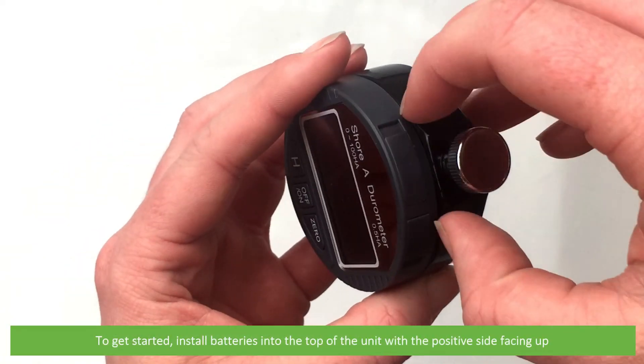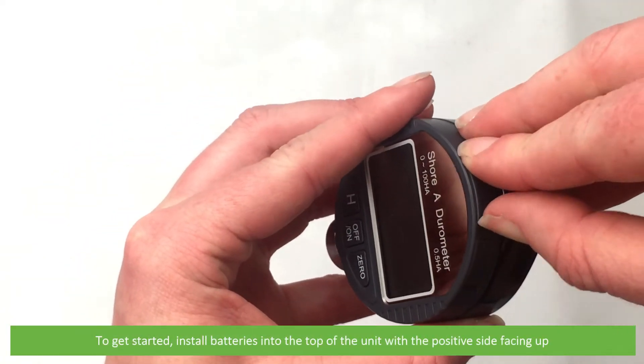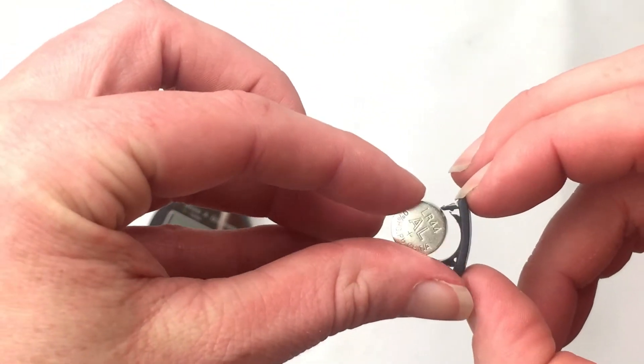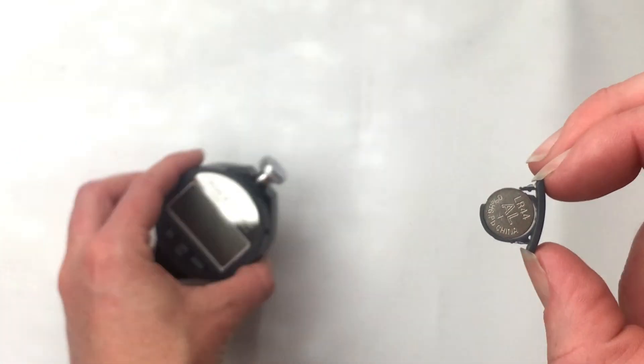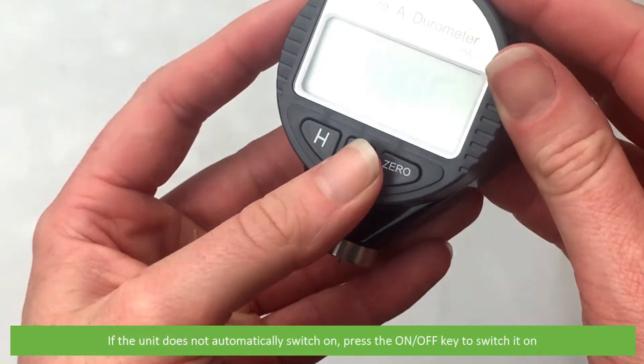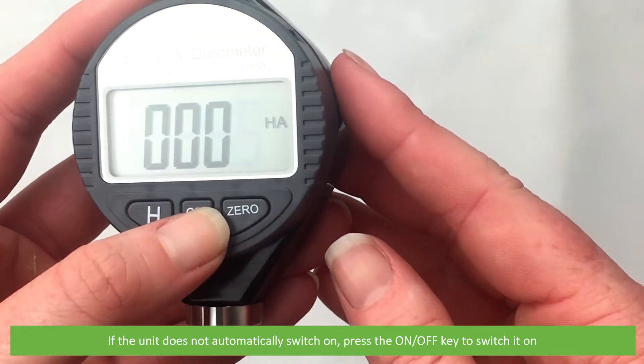To get started, install the batteries into the top of the unit with the positive side facing up. If the unit does not automatically switch on, press the on/off key to switch it on.